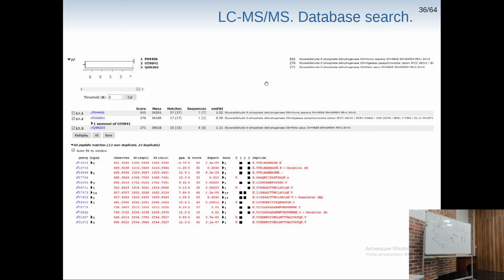Which of those three different proteins is the right one? Here is first, second, and third. Here, U is whether this peptide is unique or not, and here is where this peptide was found for which of those three hits. Can you try to make some interpretation?